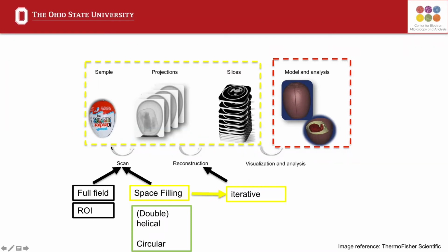So when you scan your sample, you'll get a whole collection of projections. Once the scan is complete and all the projections have been taken, they will be transferred to the GPU cluster and reconstructed. As I mentioned before, what trajectory you used will determine what reconstruction code you use. Once the data is finished reconstructing, the final output data from the HeliScan will be a 3D grayscale tomogram. It will be exported in either a TIFF stack or an NC block.